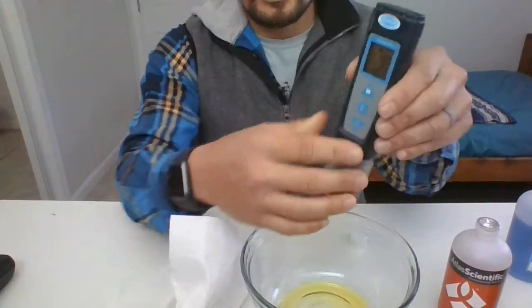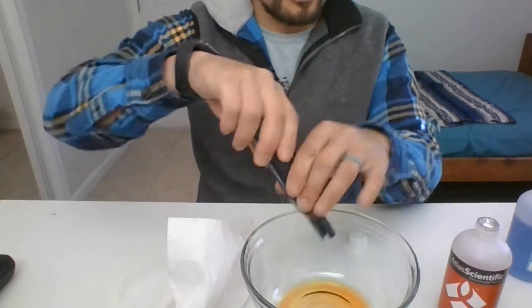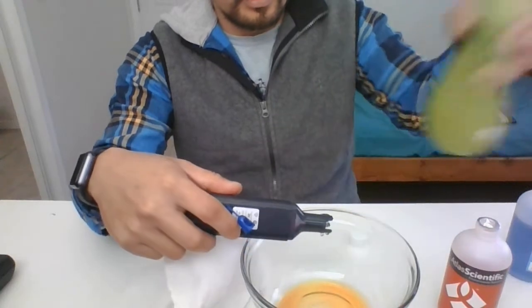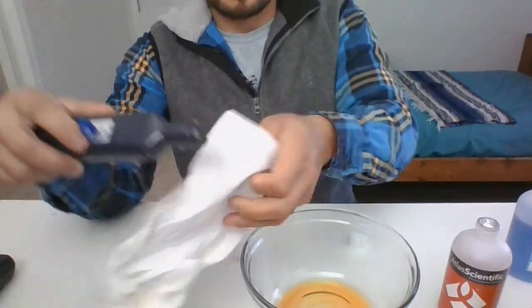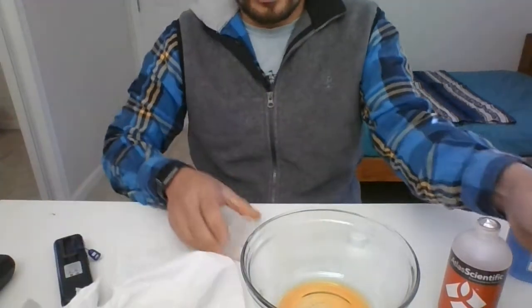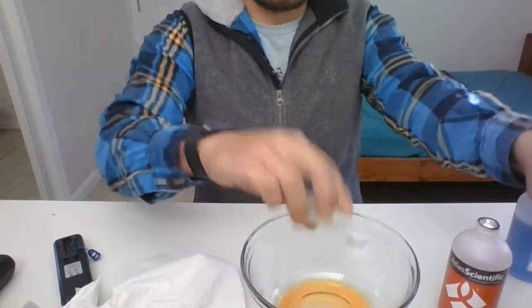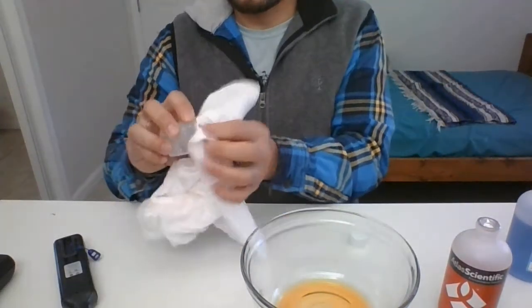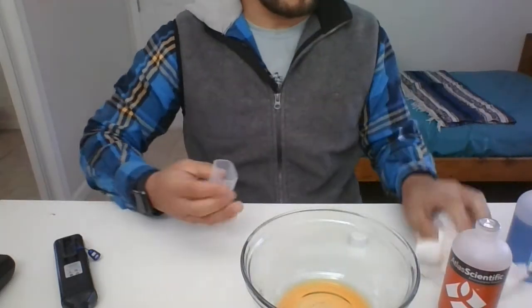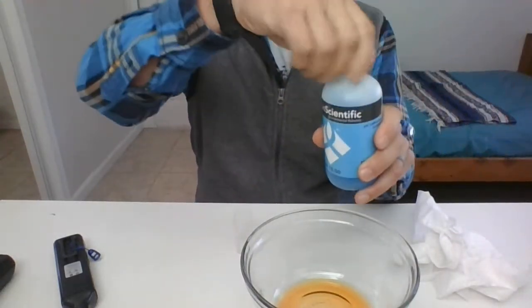Go ahead and release the contents out again from your cap. Give it another rinse with your DI water or clean water, then give it a nice pat-down dry. Dry your lid too. Then go ahead and get your blue pH 10 buffer.